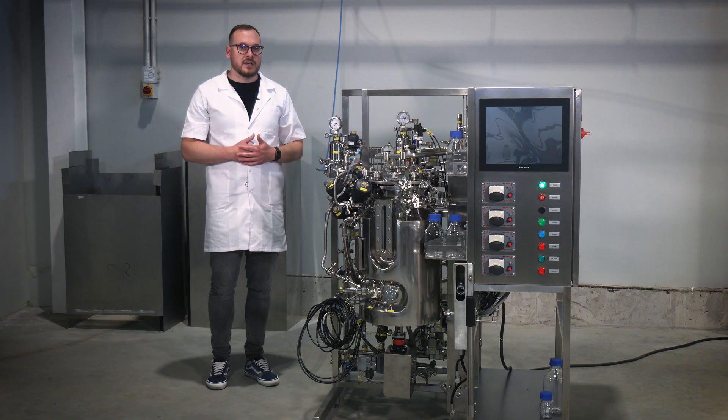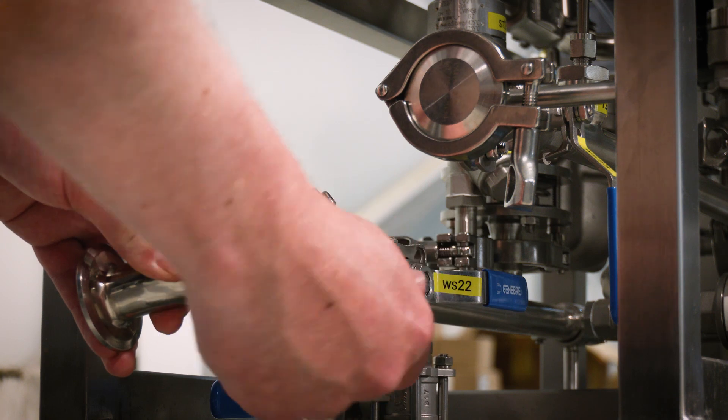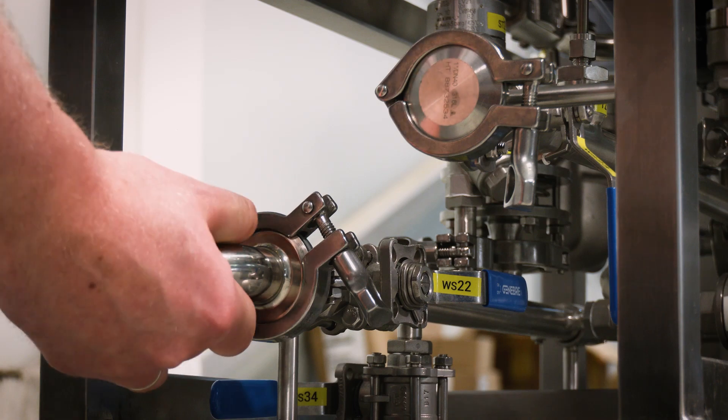Step 6. Connect the condensate discharge line to the technological skid using the appropriate hoses and tri-clamp connections and double check the proper attachment.